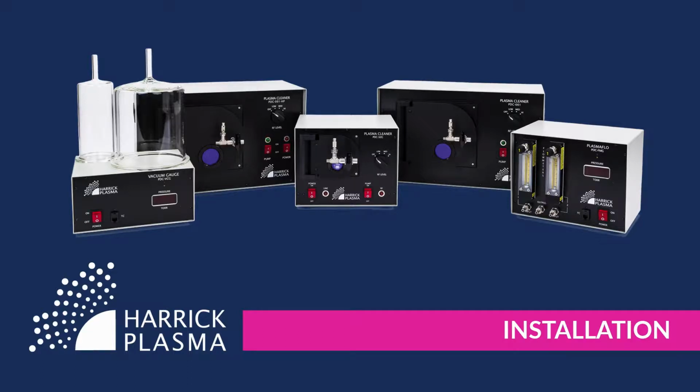Plasma is a partially ionized gas consisting of electrons, ions, and neutral atoms or molecules. It is used for the treatment and modification of surfaces through one of several mechanisms: ablation, chemical etching, activation, deposition, or cross-linking. I'm Richard, one of Harrick Plasma's staff scientists.